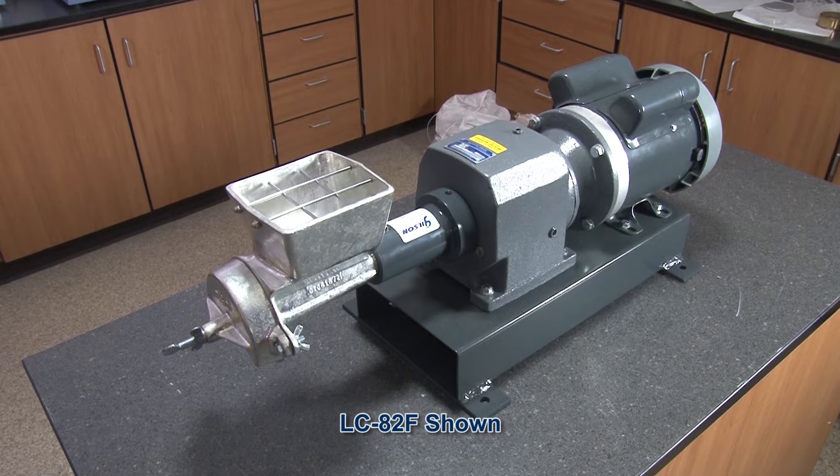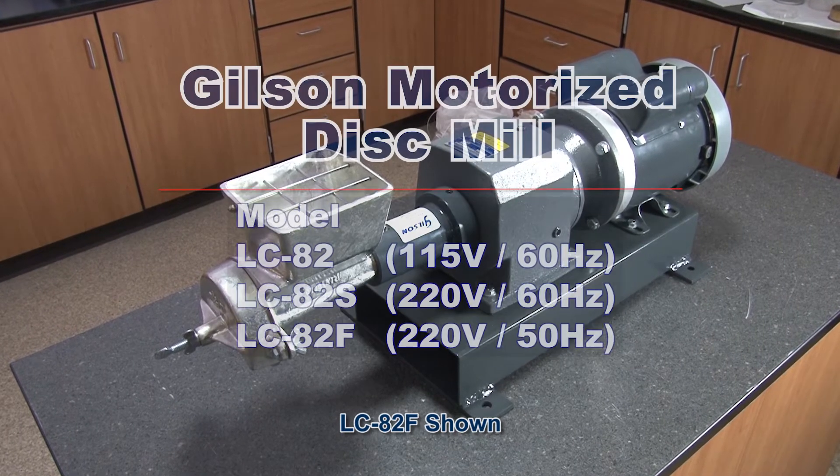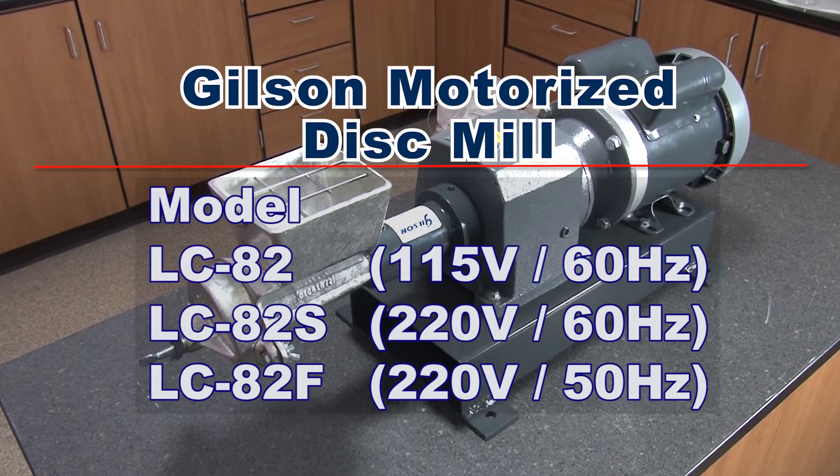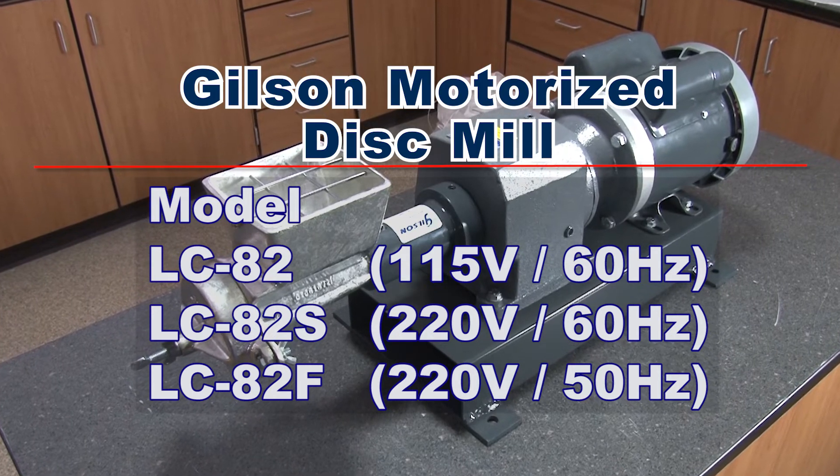The Gilson LC82 has a single phase 115 volt motor, whereas the LC82F has a single phase 220 volt motor.